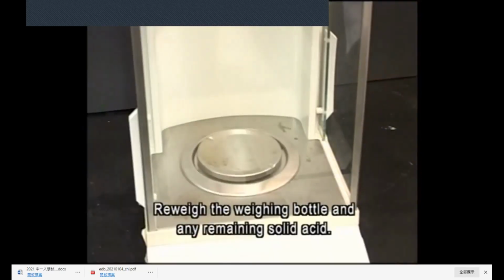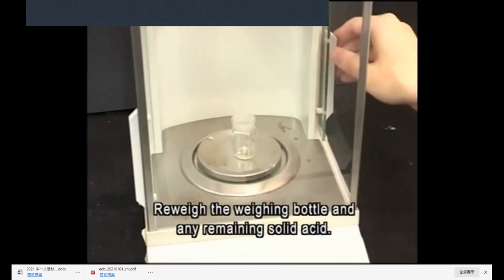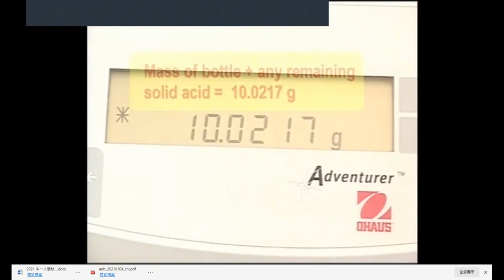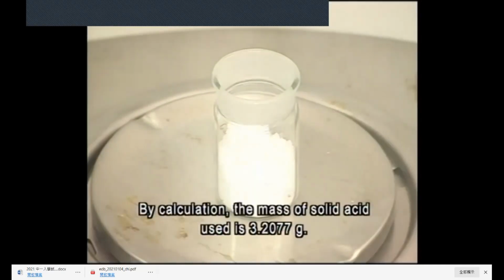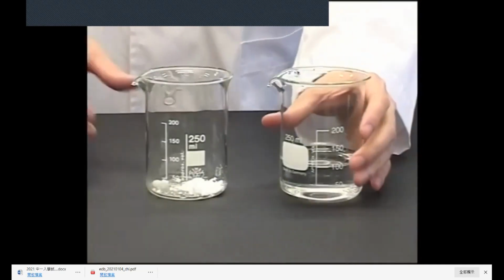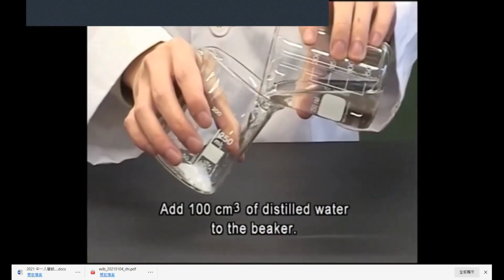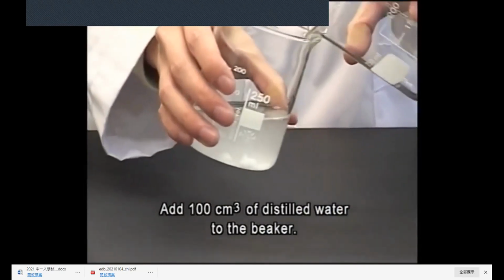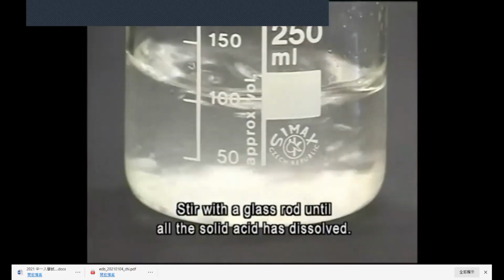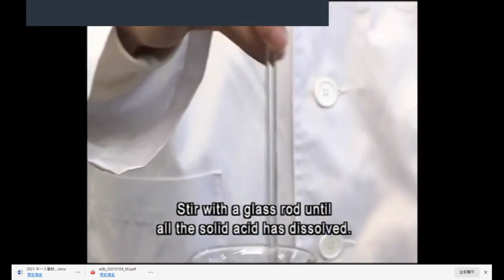Re-weigh the weighing bottle and any remaining solid acid. The total mass is 10.0217 grams. By calculation, the mass of solid acid used is 3.2077 grams. Add 100 cubic centimeters of distilled water to the beaker. Stir with a glass rod until all the solid acid has dissolved.